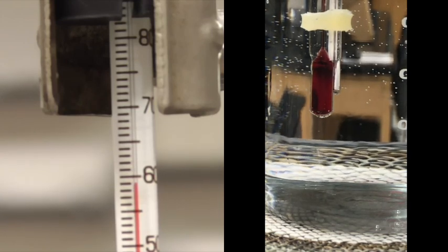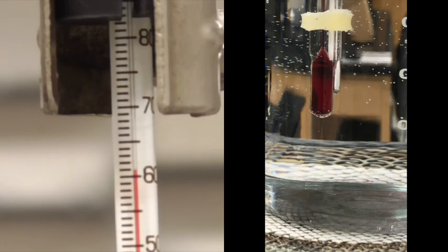Alright, so we're coming up to 60. Once we hit a little bit above 60, I'm going to pull the Bunsen burner out of there and see if it'll heat a little bit without the Bunsen burner, because of all the residual heat sitting around.